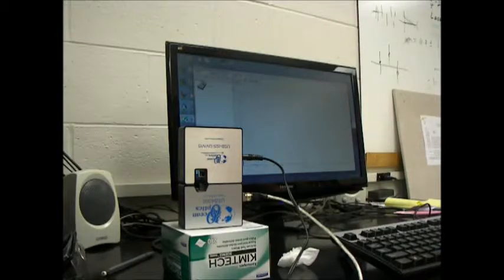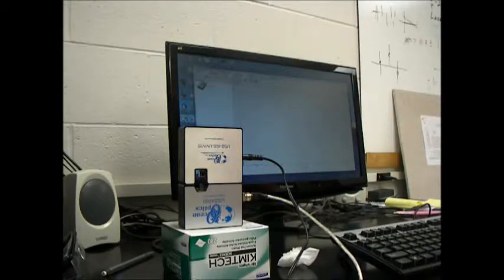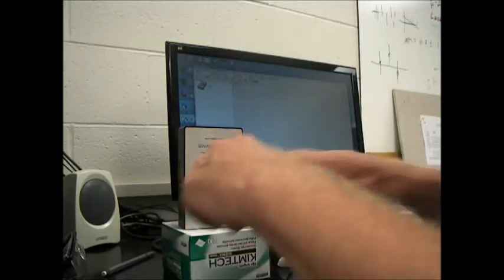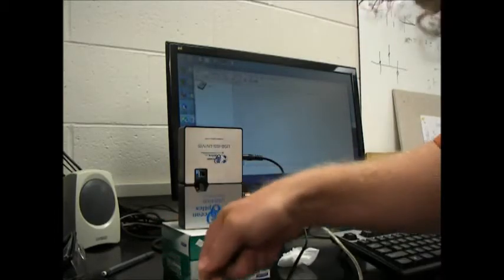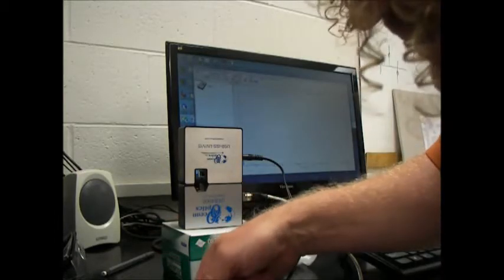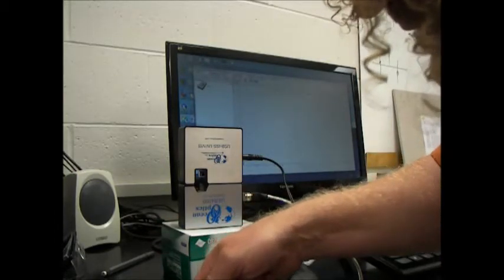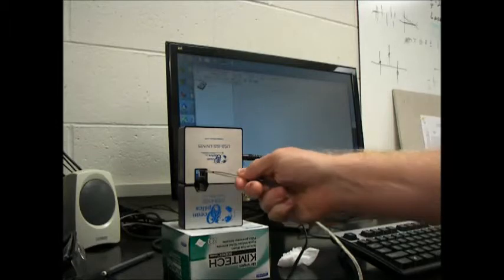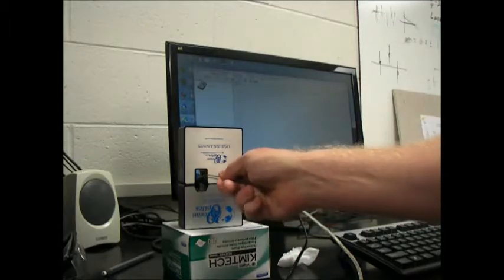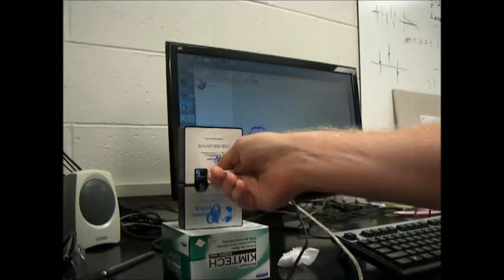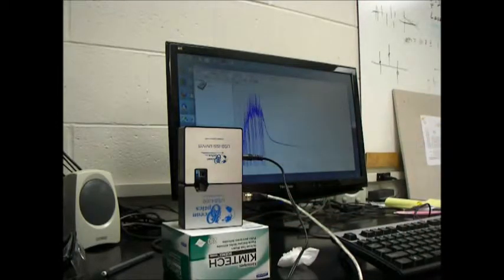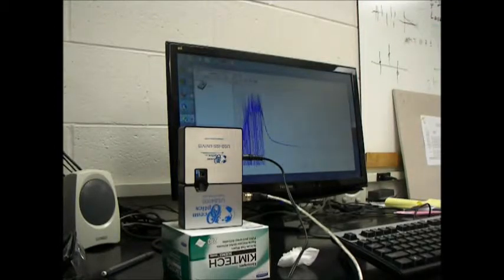You'll notice we have a nice flat, non-noisy graph. The next thing I'm going to do is take my sample and just slide it in there. I have a nice peak.